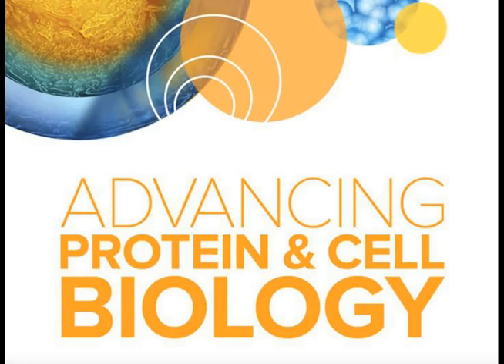Steve, what are the 3 connection rules again? Okay. The 3 connection rules. There's a do not connect objects rule. This one creates a volume map, but does not connect objects from one plane to another. So it's very good for when you have, let's say, nuclei in your spheroid. The nuclei might not actually appear on multiple Z-planes, but you still want to count the number through Z. And so this would allow you to accumulate data through 3D without actually connecting anything.